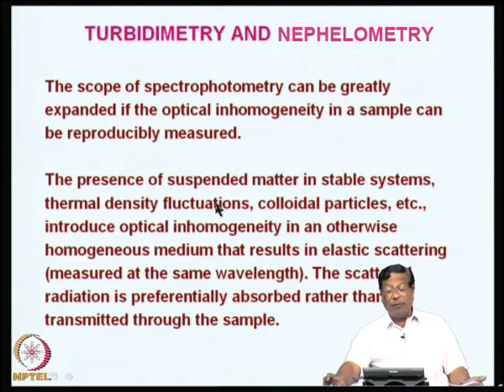So, the presence of suspended matter in stable systems, thermal density fluctuations, that also could lead to phase transitions, and then presence of colloidal particles. All these systems, if they are present in a given solution, they introduce optical inhomogeneity in an otherwise homogeneous medium.